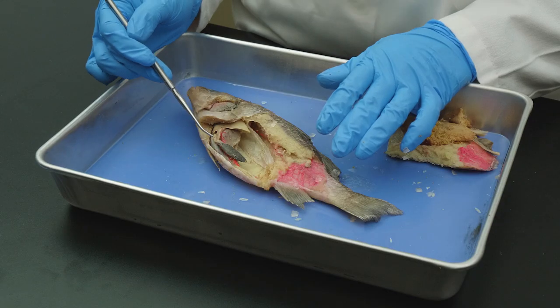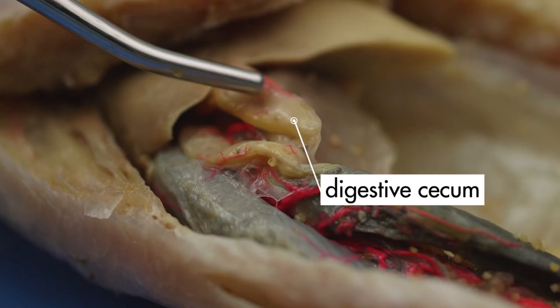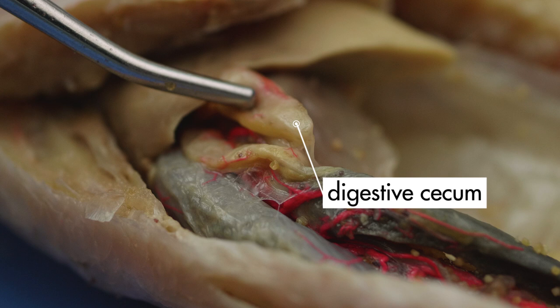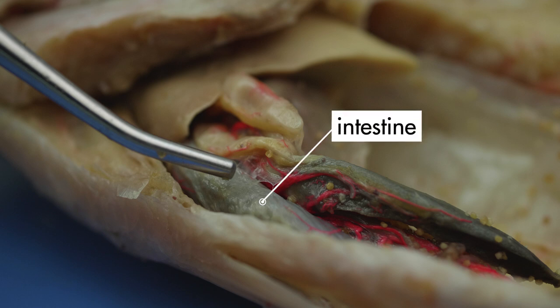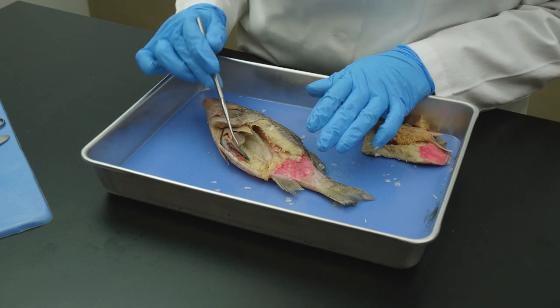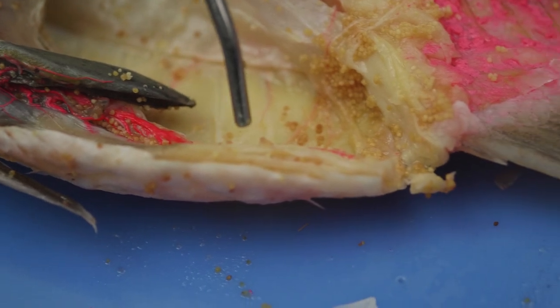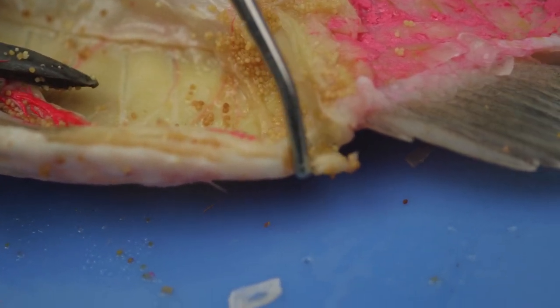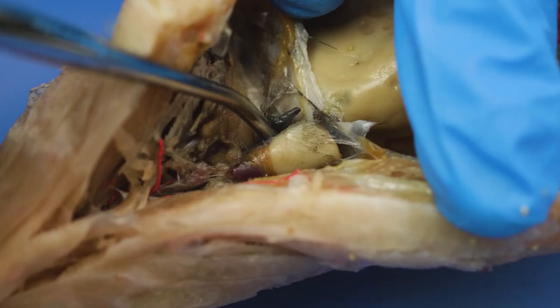Attached to the stomach are several finger-like projections. Each of these is a digestive cecum, which provides digestive enzymes to aid in chemical digestion. Digested food passes into the rather short intestine. Nutrients pass through the walls of the intestine into the perch's blood. A perch does not have a large intestine, so undigested waste passes out of the intestine and is excreted through the anus. Right behind the gills is the perch's heart.